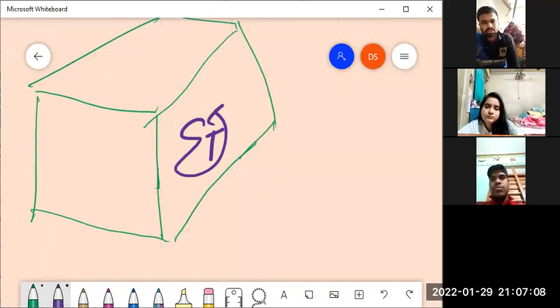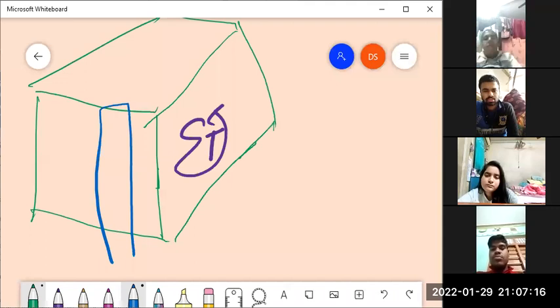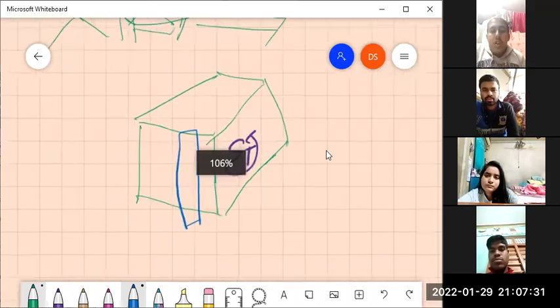Understanding? Now we can apply our knife over this block so that sectioning becomes possible. Okay. So what was the process that I discussed?